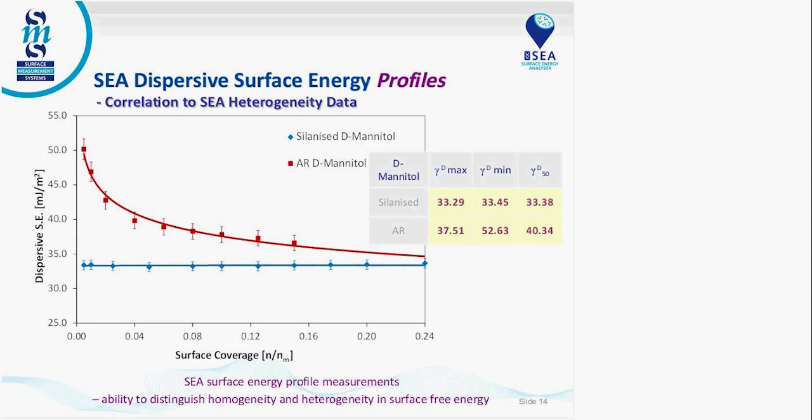Experience with carbon blacks. We do have experience with carbon blacks. Again, with carbon blacks, you would probably have a difficult time getting data at room temperature. You most likely would have to go to maybe 60, 70, 80 degrees C to get reliable retention data. Otherwise, you have to use such a small amount of material, it's not really practical. You may only put 3, 4, 5 milligrams, and that's not really representative of the material. So for carbon blacks, we often go to 60, 80 degrees C, so the probe molecules elute at a much more reasonable time. Otherwise, the peaks take too long to come out, and they're too broad and too flat.